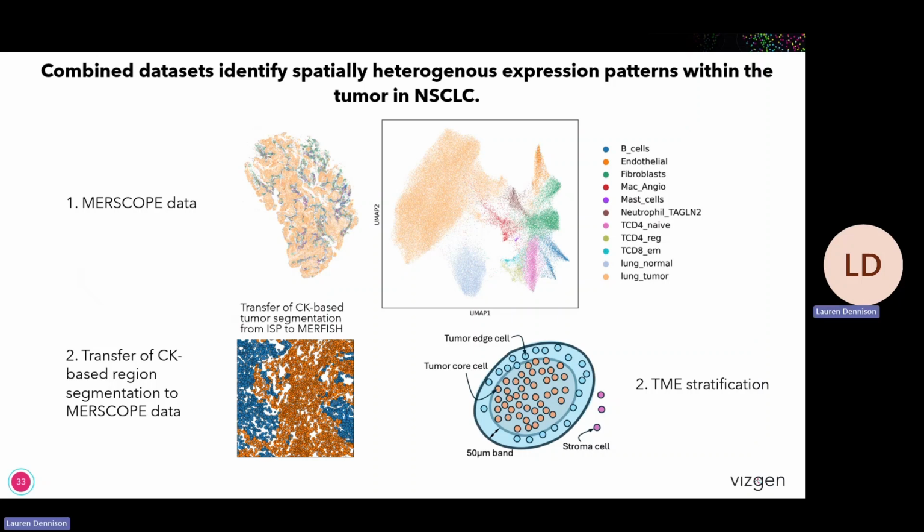And that is something that really highlights the use of the protein here, because only the protein signal will give us the sharp bands that we need to do accurate band construction, so to say. So using the protein signal as anchor, we can integrate the gene expression data. And so having this compartmentalization, we can then ask interesting questions like, okay, if we have cells inside the tumor and at the edge, can we identify gene expression modules that are different between these two cell types? So do cells at the center have a different transcriptome than cells at the outside of the tumor?